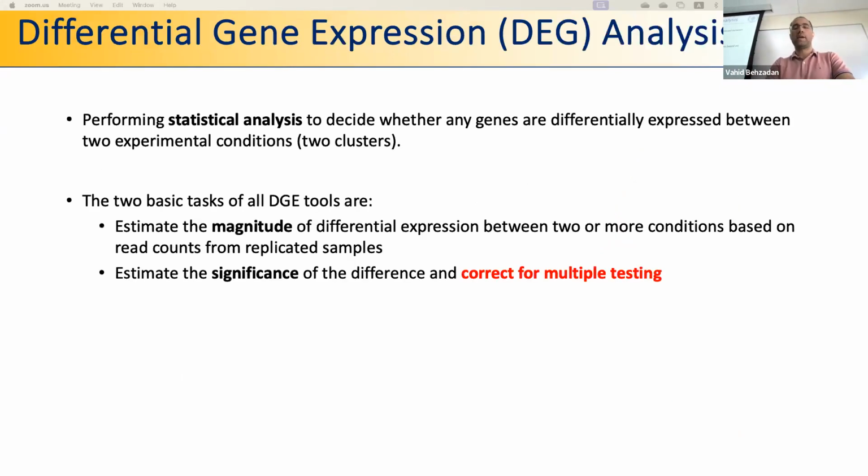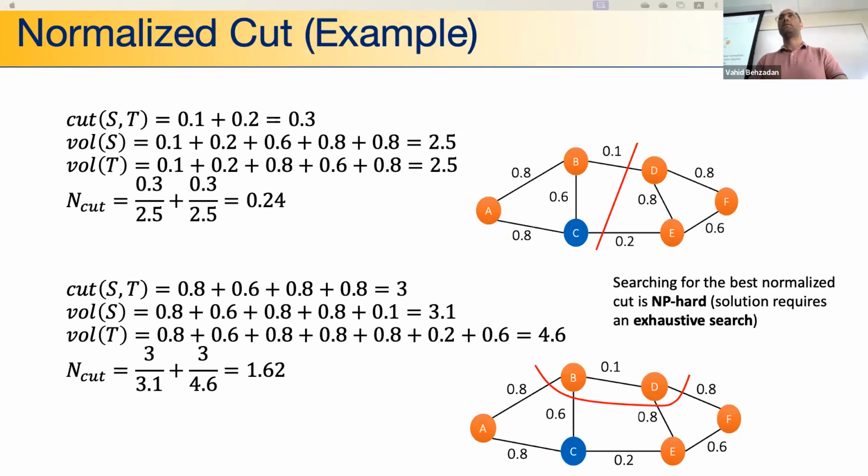All right, so once you created clusters, right? Yeah, sure. In your graph, each node, is it representing a gene or cell? A cell. Expression matrix. The weights, sorry? So each node is a cell. So how are you getting the connection between cells? It's by calculating the similarity, and that similarity could be Euclidean distance or cosine distance or any other kind of measurement. Let's say that that's where the weights are coming from.